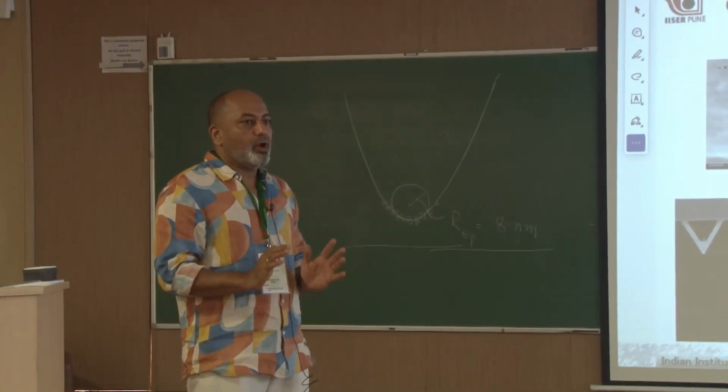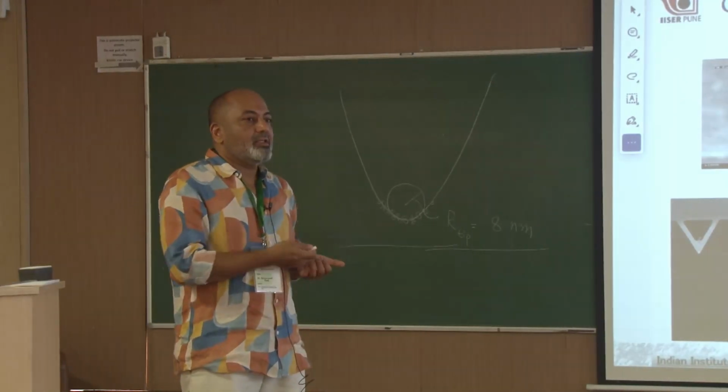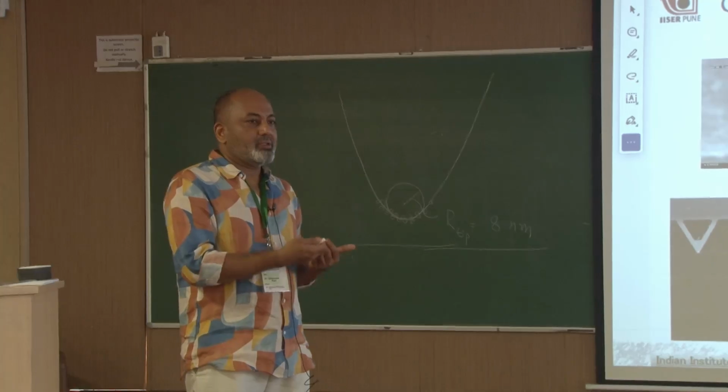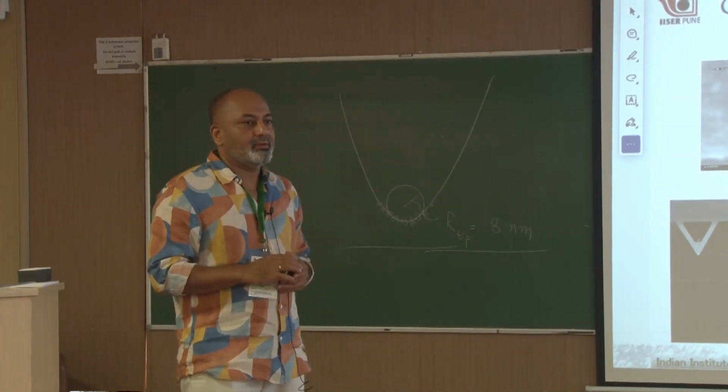But it all depends on what interaction you are probing. If it is a slowly varying interaction, it is not atomically sharp. If it is an extremely exponentially varying interaction, it is atomically sharp, like that.